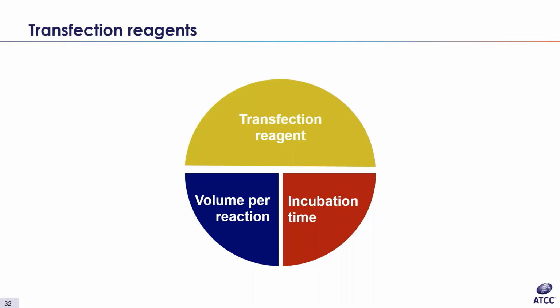Next, you often have to optimize the ratio of lipid to DNA for the cell type and substrate that you're working with. Most manufacturers will provide guidelines, but some optimization should be expected. Lastly, one should optimize the incubation time for the lipid in contact with cells. If you're using a low or no serum transfection medium, you do not want to leave the cells in the medium for too long, and some complexes can become toxic to cells. So again, most suppliers will provide guidelines, so optimization may be required for your specific conditions.